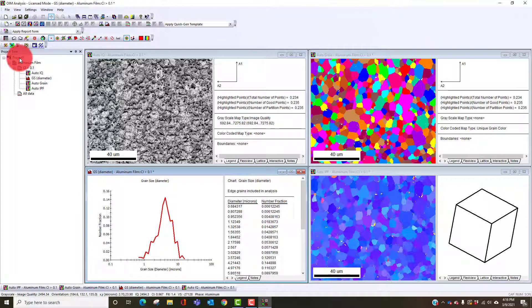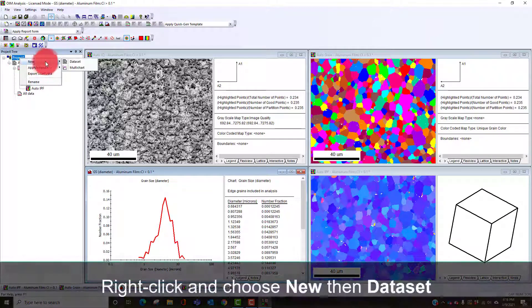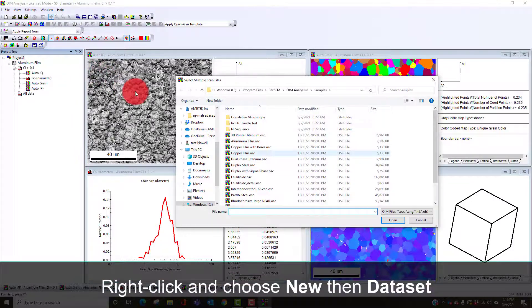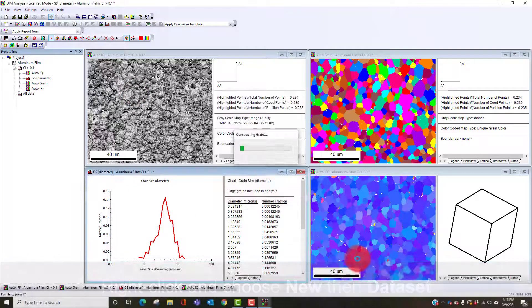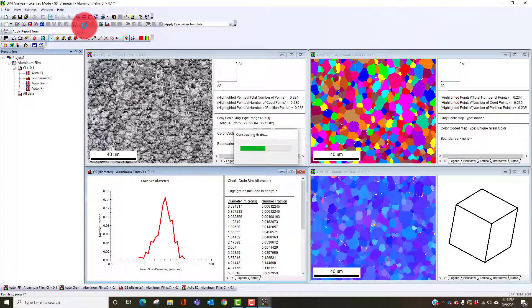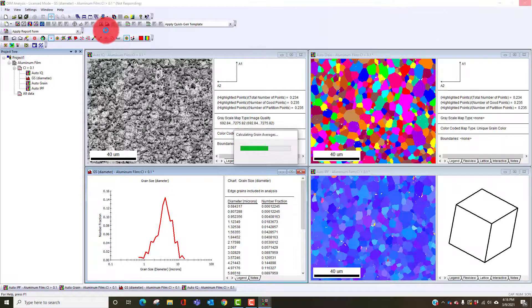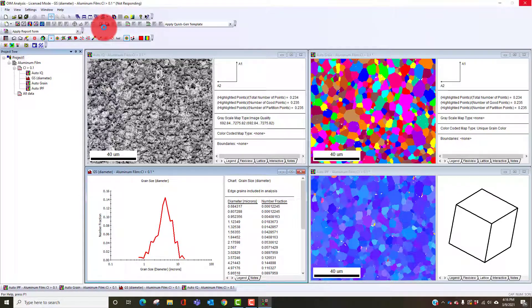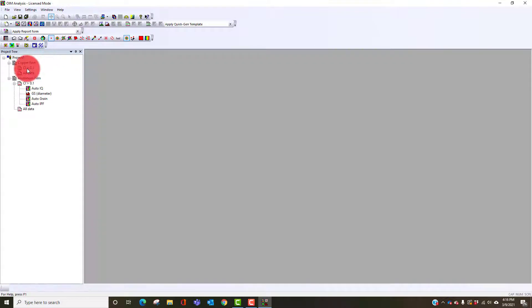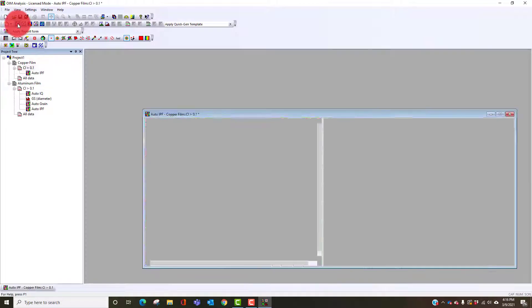One more thing I want to show about grain size is what happens when we have a twinned material. This is now a copper thin film that will have quite a bit more twinning and we'll be able to see that when we open the dataset here. I'll close all these again and look at our orientation map.